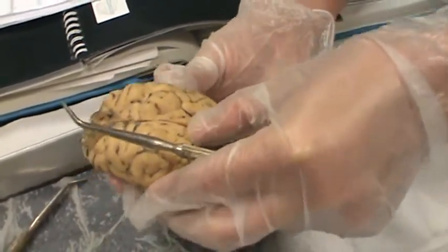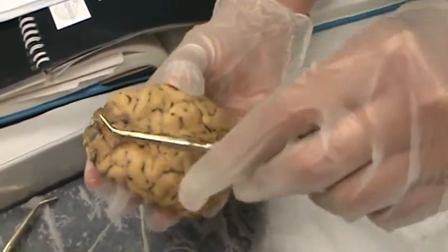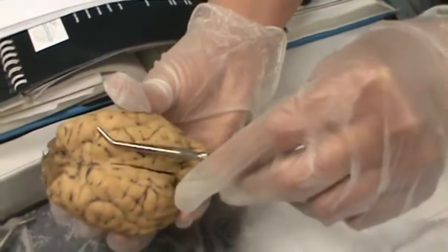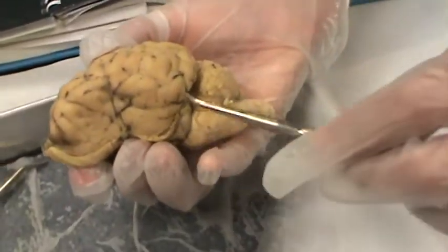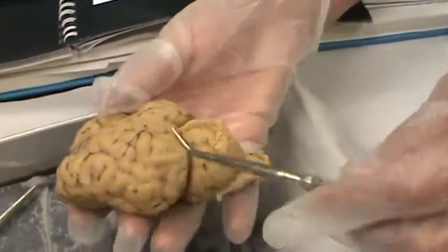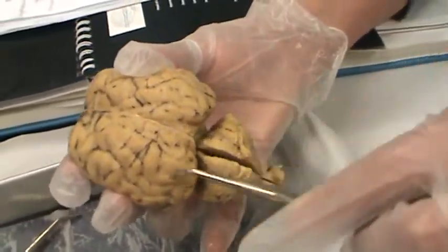The frontal lobe is the front part of the sheep's brain. The parietal lobe. And then the temporal lobe is this lower part. And then the occipital lobe is in the back of the cerebrum, which is this occipital lobe.